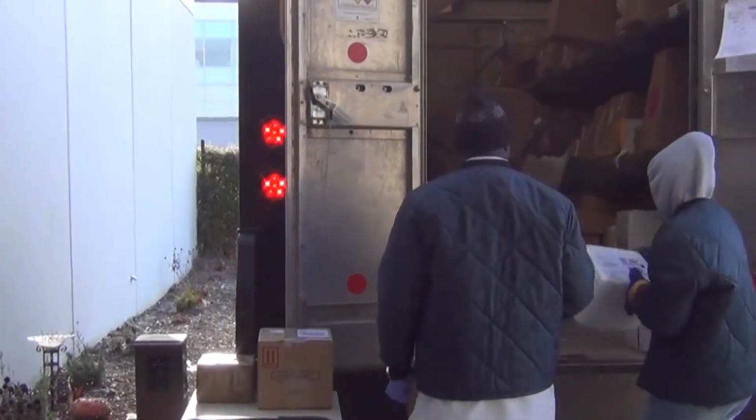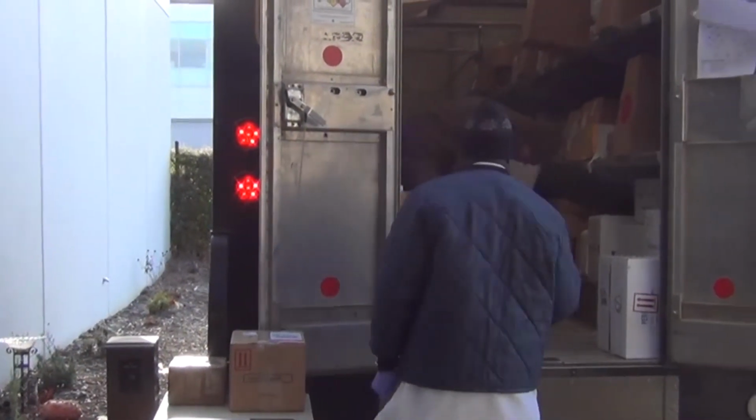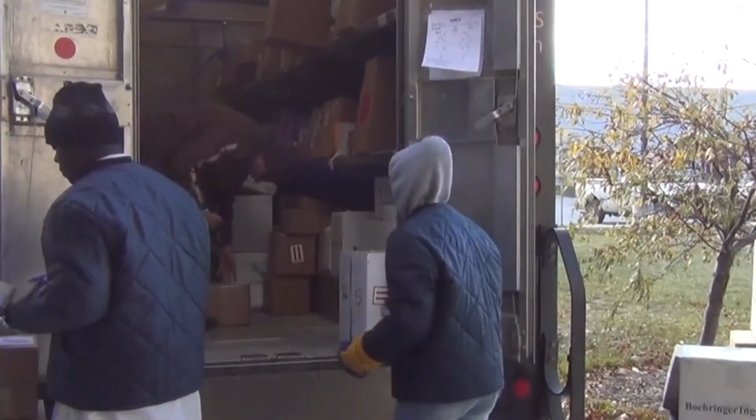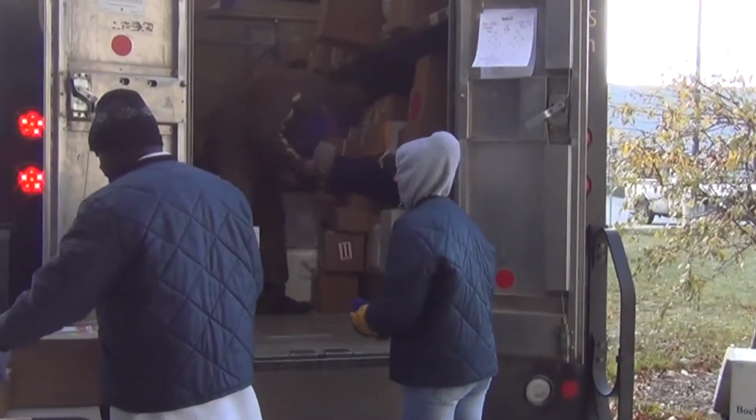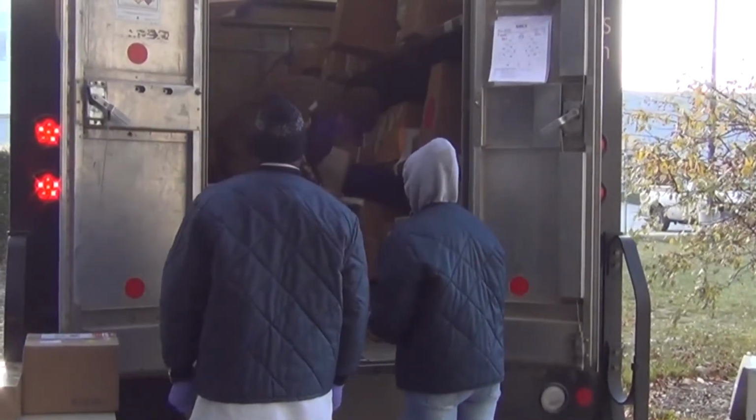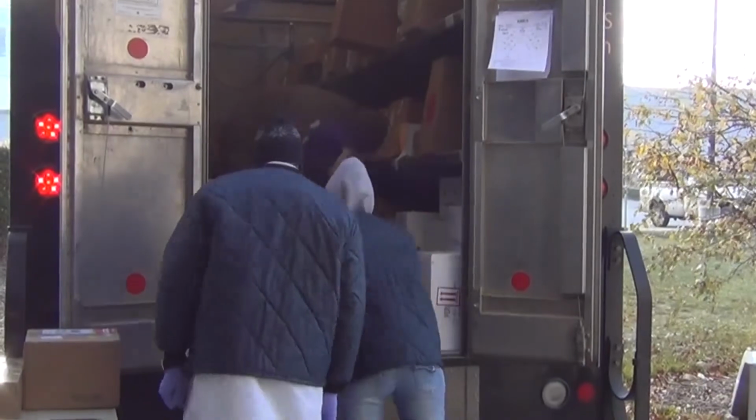Several tests have an 11:30 a.m. cutoff for same-day service, so packages arriving later in the day may delay your results. First off, the diagnostic lab sorts through the packages to determine whether they go to the serology or pathology mailroom.